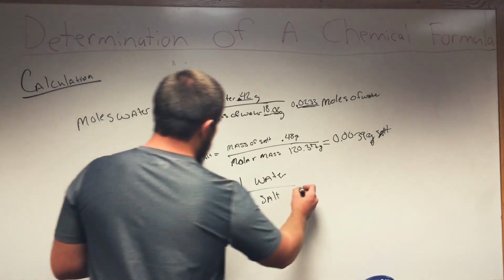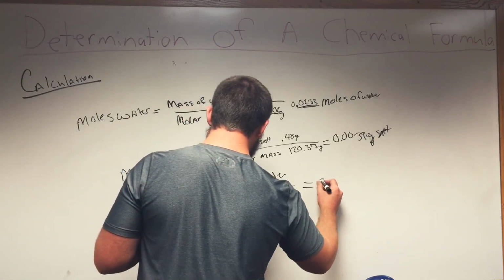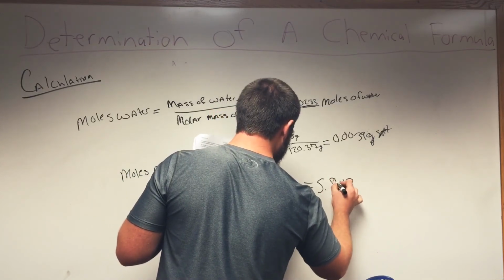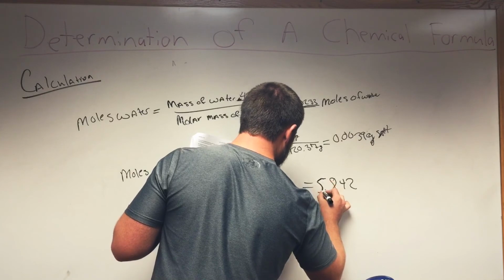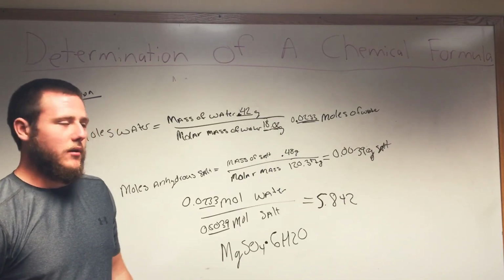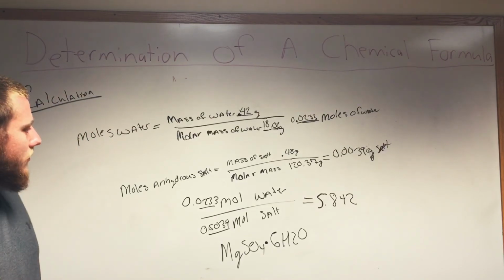And that gave us a number of 5.842. This here's the empirical formula for the experiment.